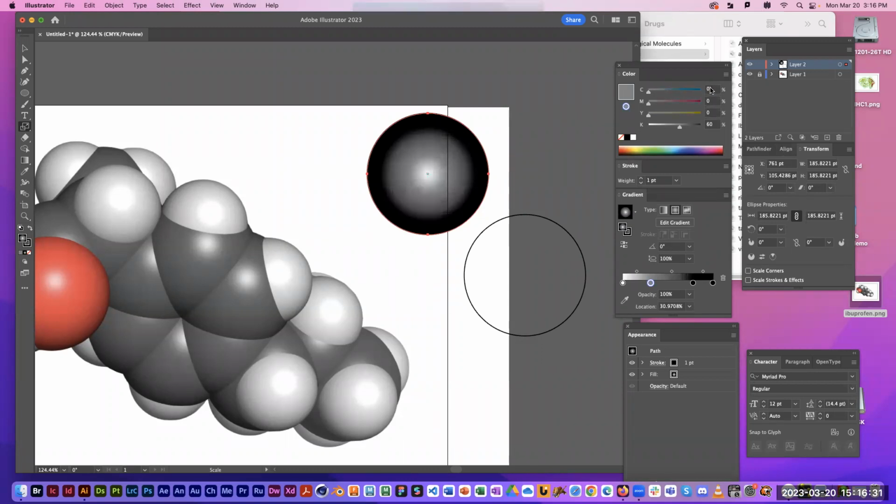I could make it a slightly bluish gray if I really wanted to. I could just throw a teeny bit of cyan in there. That's not really necessary, but I find that adding a little hint of color to the gray makes it look a little better. My highlight, I don't know if I want a perfectly white specular highlight. I might throw a tiny bit of cyan and maybe a little bit of black in there to have a softer highlight. My core shadow, I never want this to be completely 100% black. I'm going to throw a little bit of cyan in here as well. And then maybe I'll go about 80% black for the core shadow. Then my reflected light should be a lighter version of that. So maybe 5 on the cyan, and instead of 80, do, I don't know, 65, but that's almost my midtone color. So let me go a little darker, maybe 70.